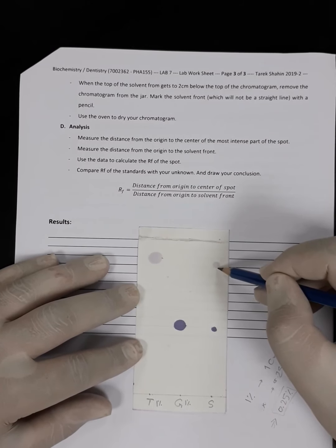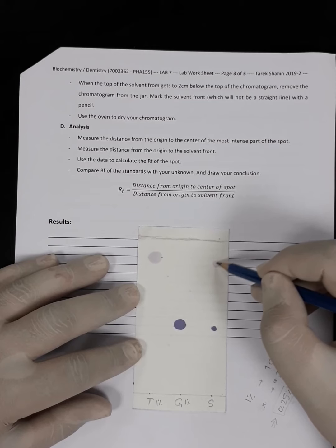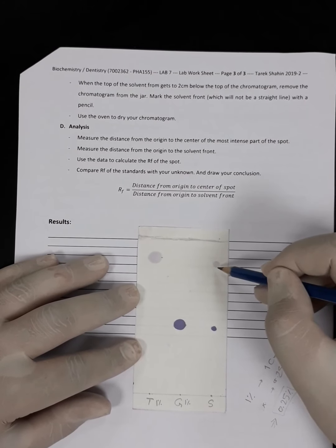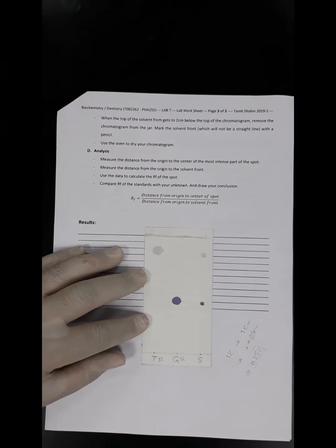And the same for the tyrosine. The circle here, or the spot here, has a much lower diameter than the standard tyrosine. So we will say again the contained amount of tyrosine, or the contained concentration of tyrosine inside the sample, has a lower concentration than 1% of the standard spot.